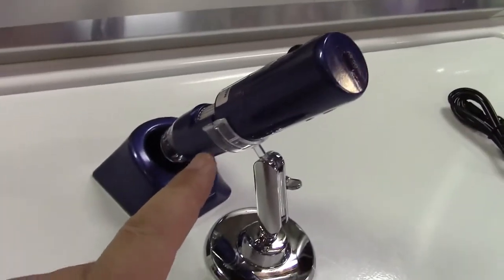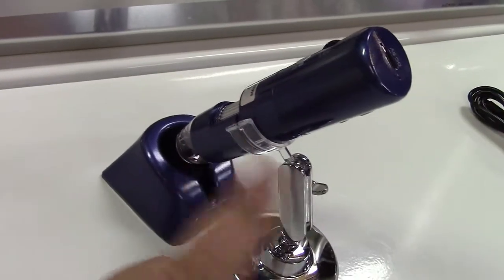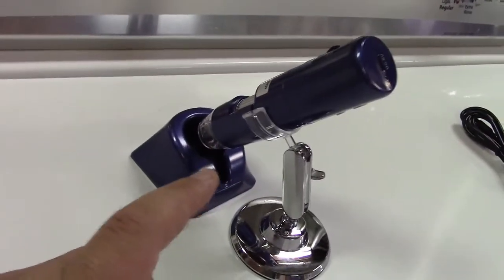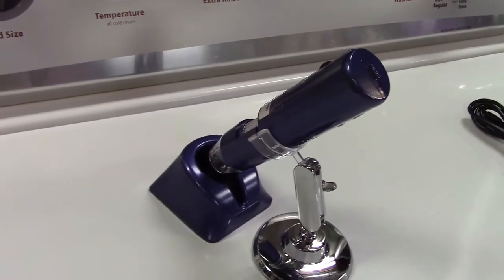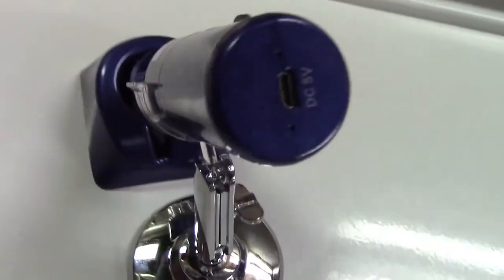The way the Wi-Fi works is this microscope will produce its own SSID, or its own wireless network. And then on your device, whatever it is, you go into your wireless network list, find this, and connect to it, and then it has a direct transfer wirelessly to that particular device, whether it be a phone or a tablet or a computer or anything like that. If you're using a computer, you can also hook it up with the USB cable, which is what I'm going to be doing today. And this also doubles as a charging cable, which will plug in right over here.